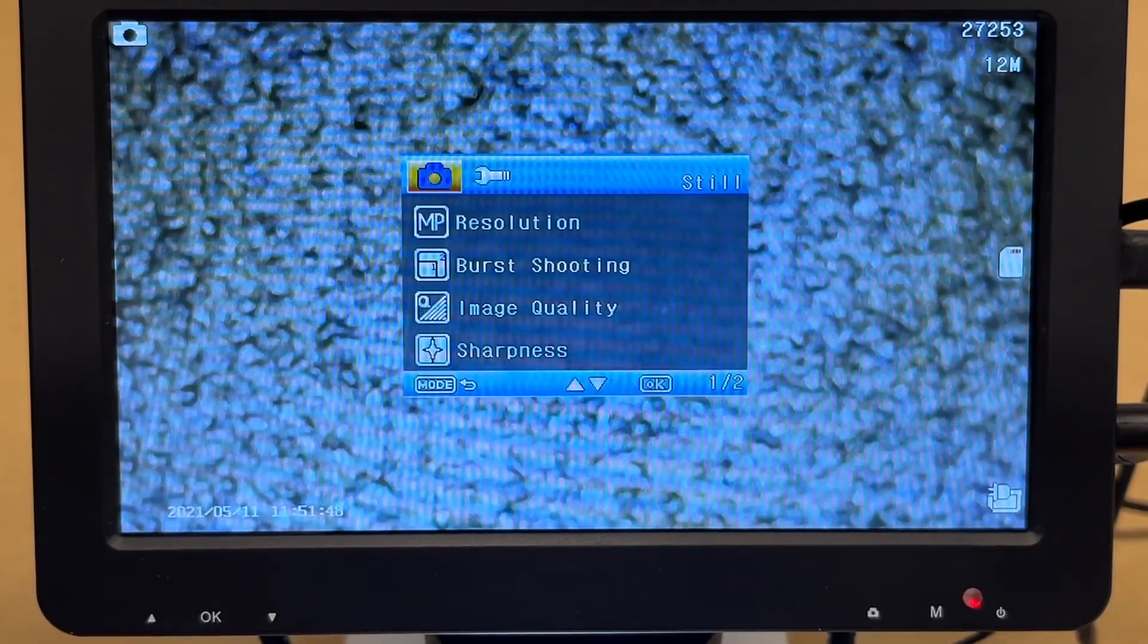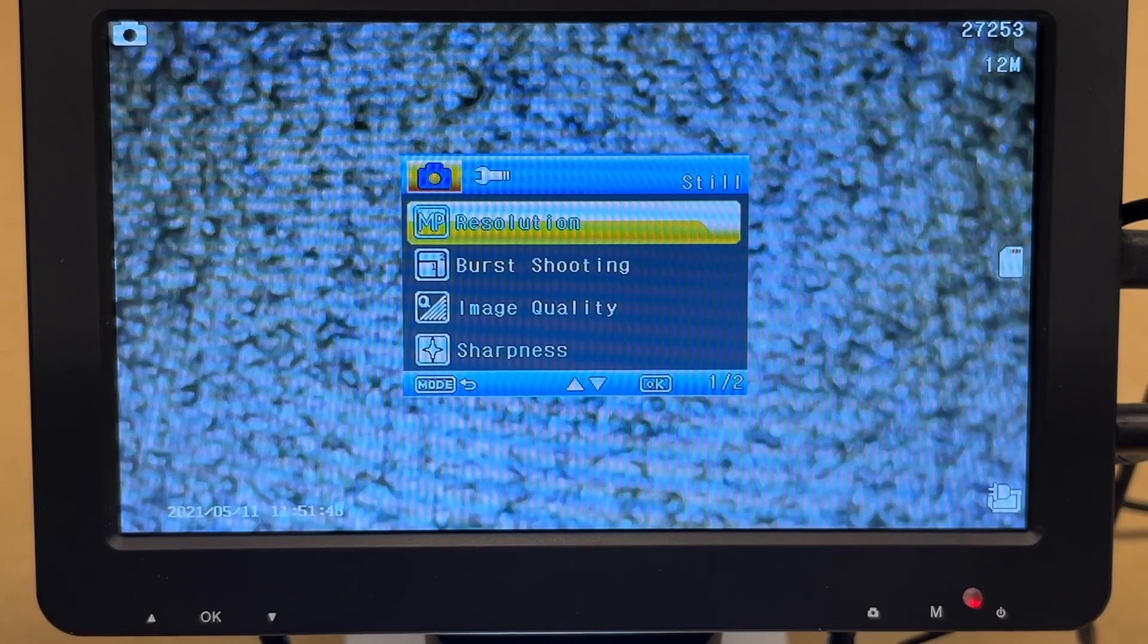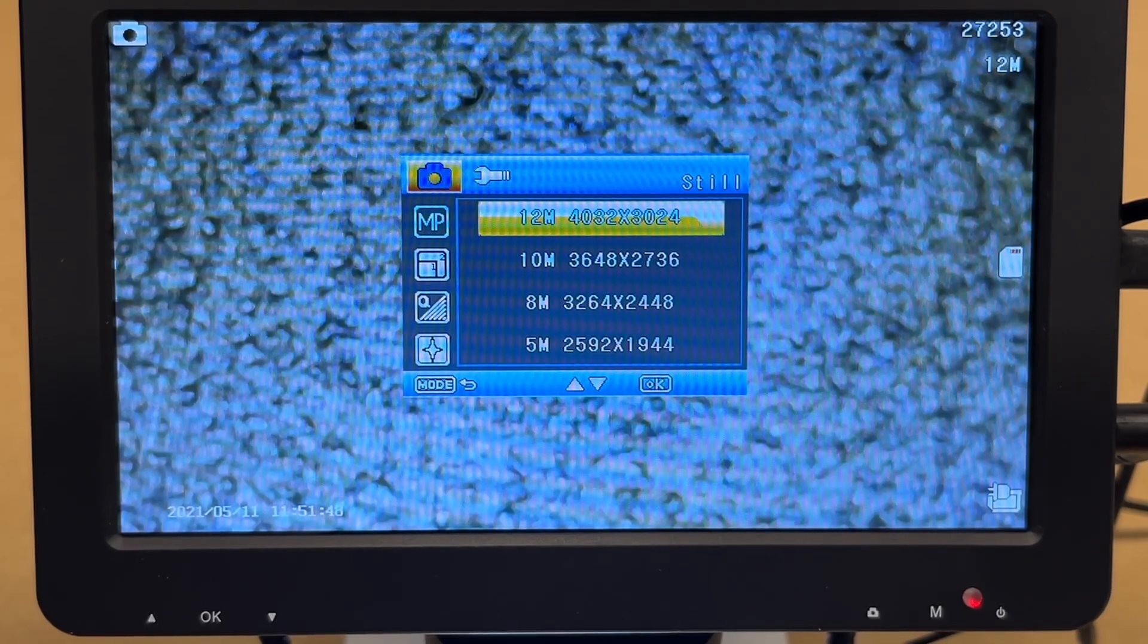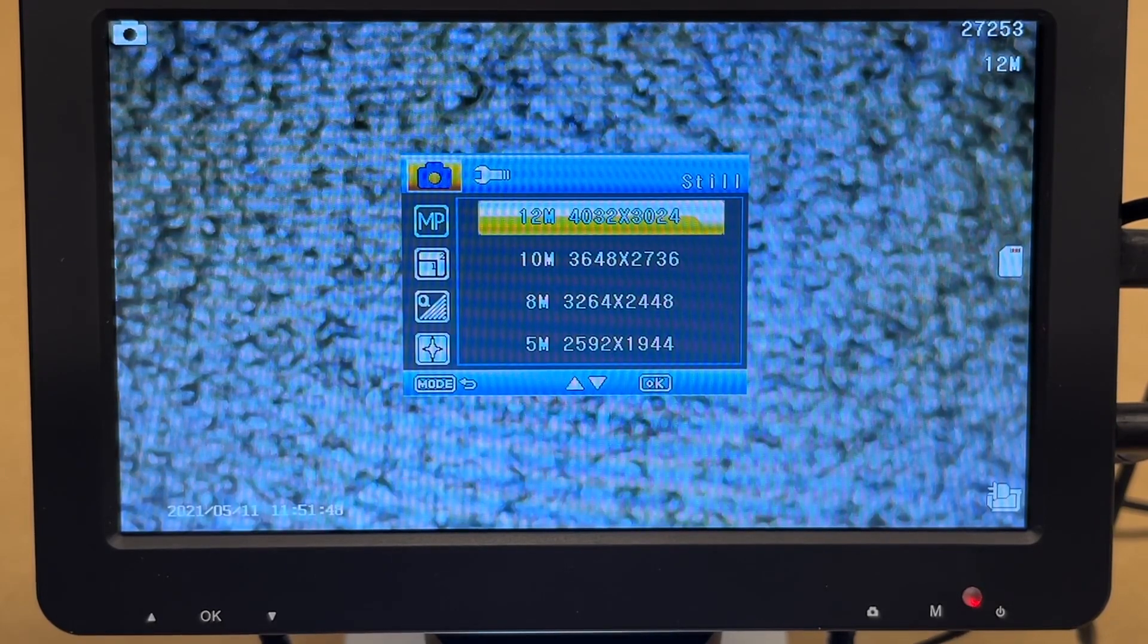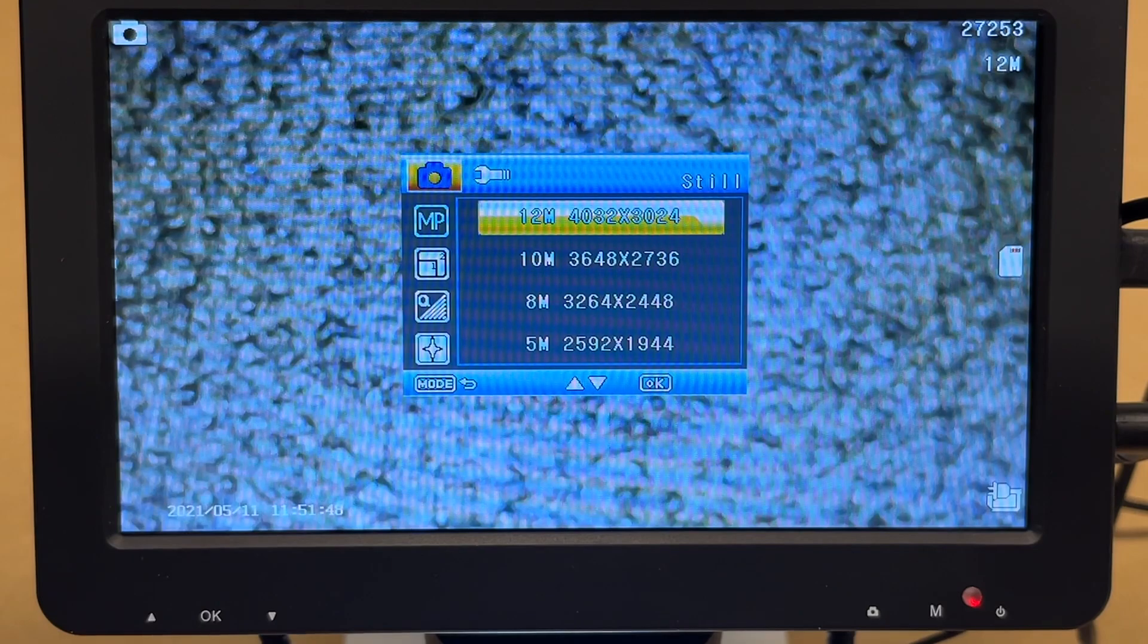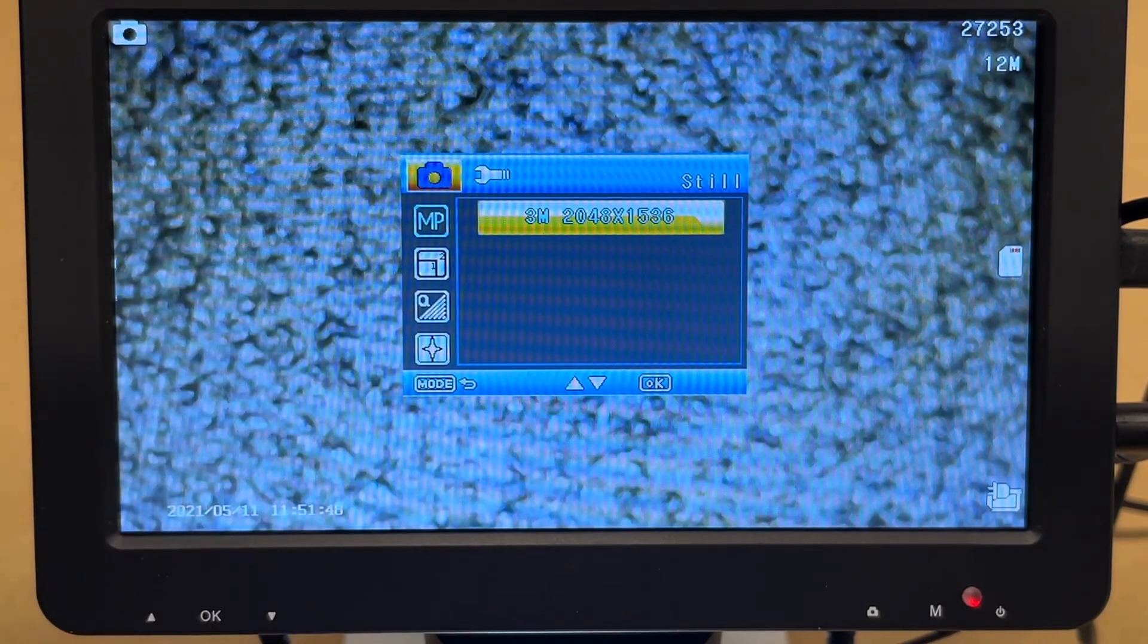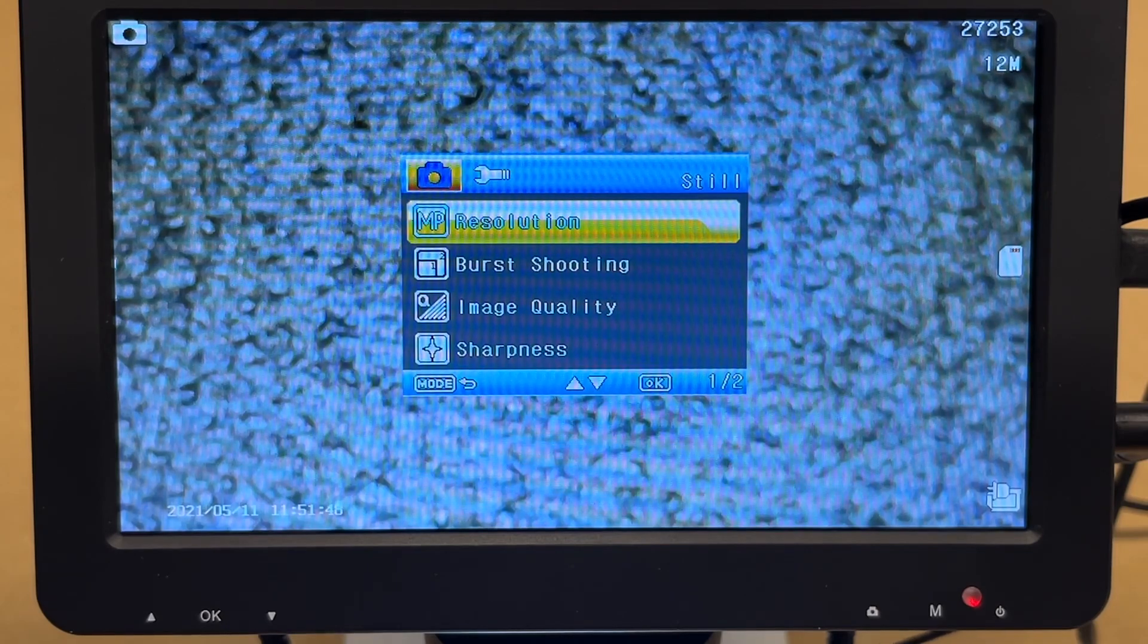So I'll go over the interface on the screen. I'll press the M button for menu. And we have the menu here. And then if we press down, we have resolution. I'll press OK. And here we have the resolutions this supports. And these are photo resolutions. So it's currently set to 12 megapixel, which is 4032 by 3024. And then you have lower resolutions here you can choose from. It even goes down to 3 megapixel.